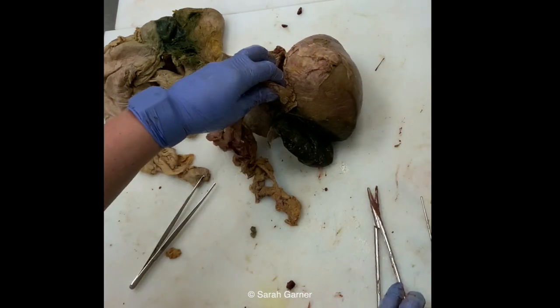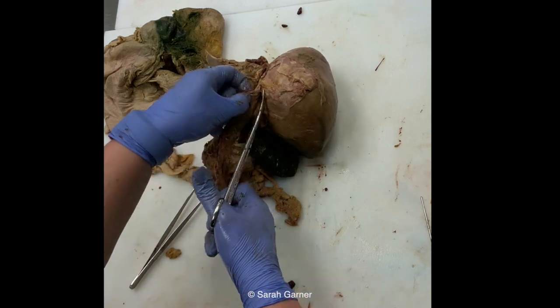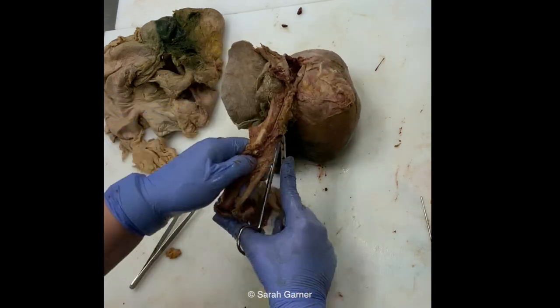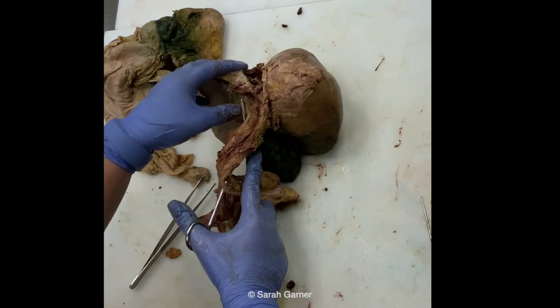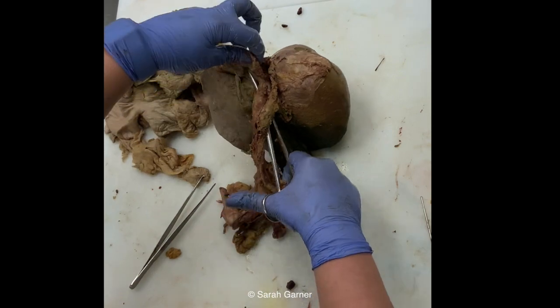Okay, so then you can trim it off because you don't want to weigh the liver with the big IVC attached. So trim off your IVC. If you do see something abnormal, you want to take a picture of it and probably a section of it, right?